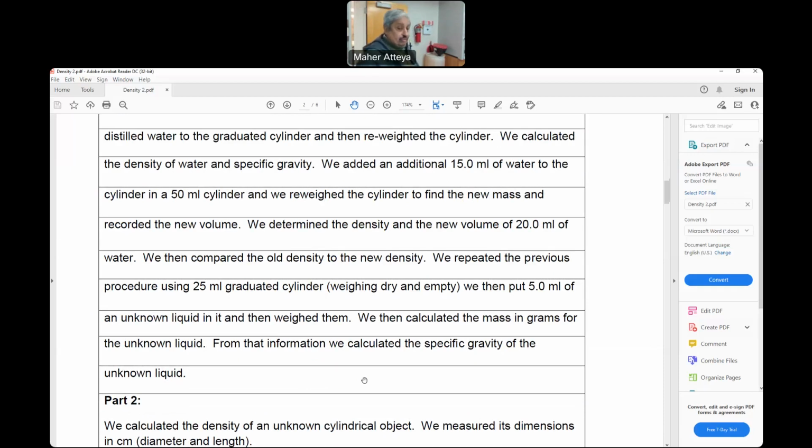Then we went to the procedure. We measured the theoretical dimensions of an object in the procedure, as well as the real object, and determined, in both cases, the theoretical or virtual one on the procedure itself, and here the real one, the volume in centimeter cubed, correct?